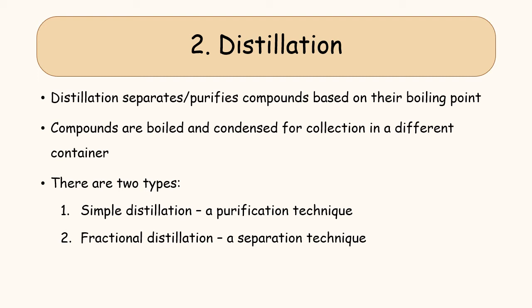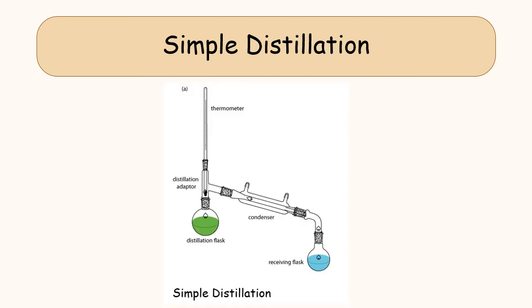There are 2 types of distillation. Simple distillation, which is a purifying technique and also a way of testing purity, and fractional distillation, which is a separation technique. So simple distillation looks like this.